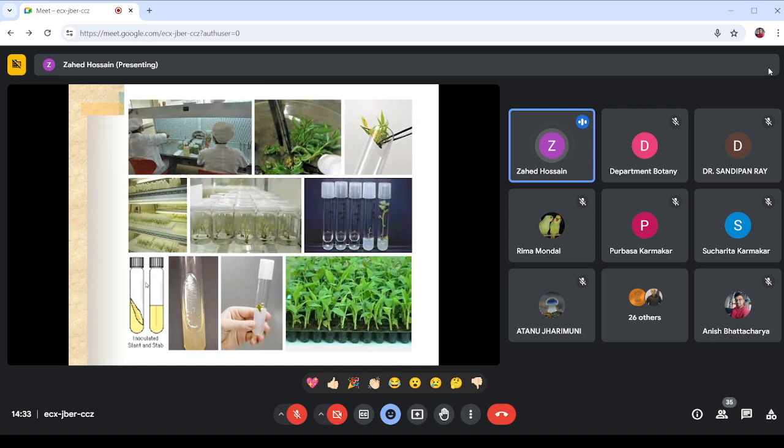So these are some photographs of different stages of plant tissue culture. On the first panel, the left hand panel, you can find two workers, or you can say skilled technicians, doing this culture. Here this particular device or instrument is basically a laminar hood. I will explain this later. This particular cabinet provides the aseptic condition. As I mentioned, you can't do your plant tissue culture at home unless you have this system, because this platform will give you the aseptic condition.